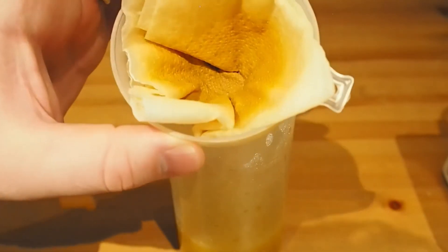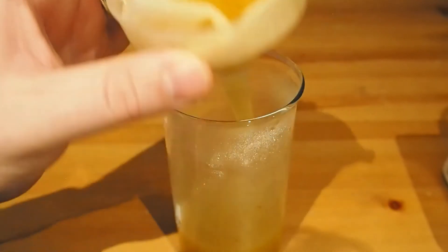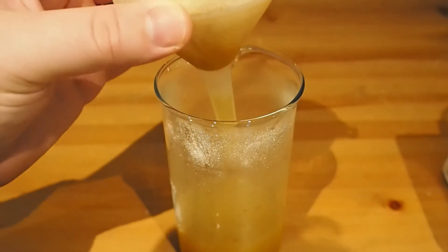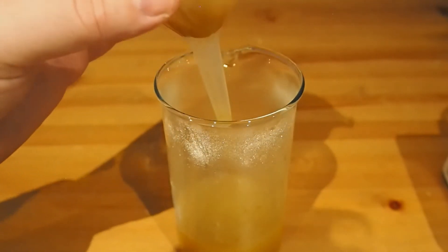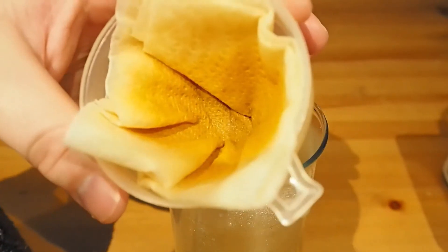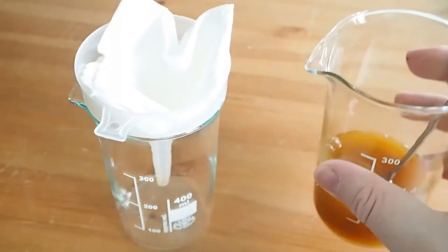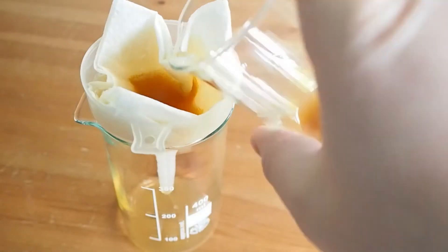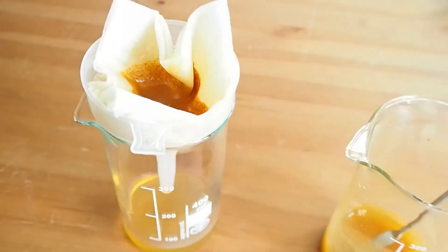There we go, that's filtered. You can see there's plenty of yellow solid that's been captured. We're still waiting for some of the filtrate to come through. There's our liquid. Unfortunately there does still seem to be plenty of cloudiness in there. We'll see what that looks like after we've let it cool down. So as you can see it's still very cloudy. We've got that ferric sulfate, that iron 3 sulfate. So we're just going to filter it off and collect that iron 3 sulfate.